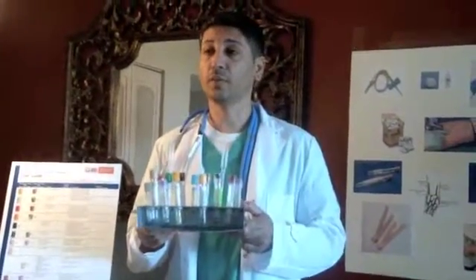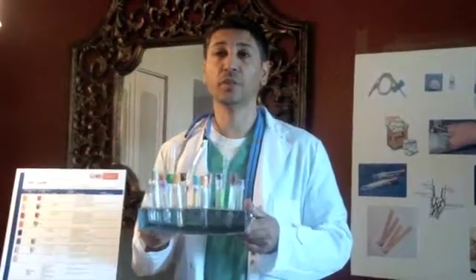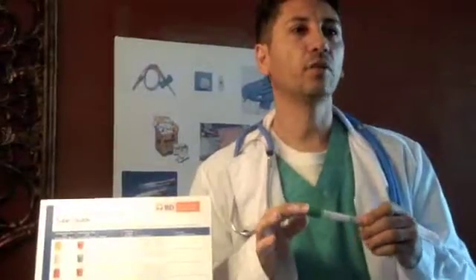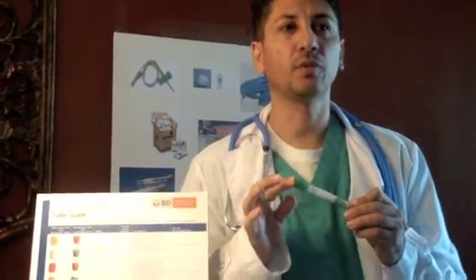For physics and chemistry, they are usually made of glass for better resistance to heat and corrosive chemicals and longer life. The ones made from expansion-resistant glasses can be placed over a burning flame. Culture tubes for biology are usually made of clear plastic by injection molding and often discarded after use. The tubes are covered with a colored plastic cap. They often include additives that mix with the blood when collected, and the color of the tube's plastic cap indicates which additive the tube contains.